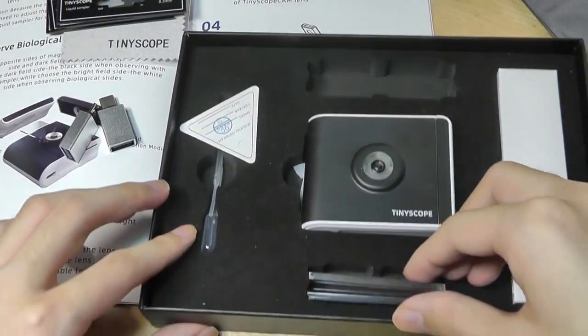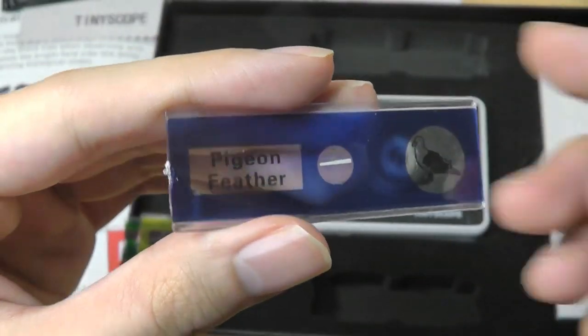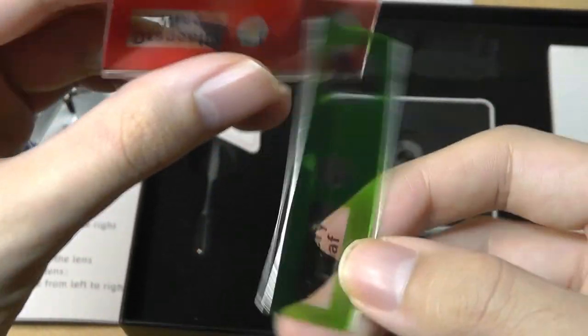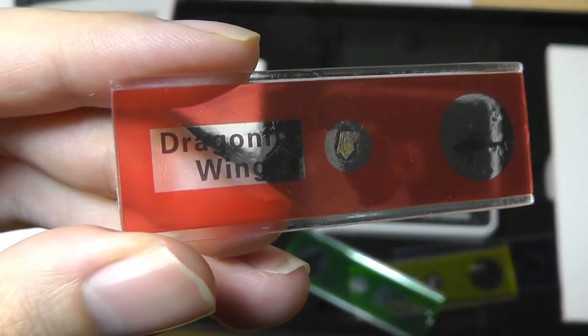So we've got these glass observation slides for liquid and for different sizes of objects. We also get a few samples included for demo purposes, including a sample of a pigeon feather, dandelion fluff, a celery leaf, and finally a dragonfly wing sample.